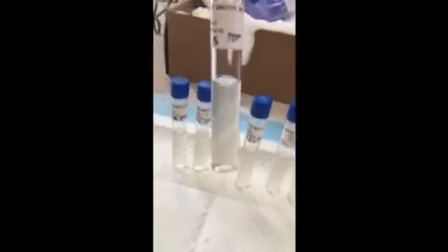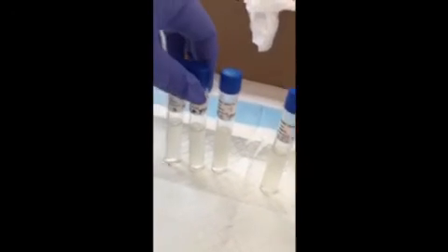Okay, this is for salt tolerance and pH testing. It's been 24 hours and you can see all of the broths are positive because all of them show turbidity. For the Epi5, you can see it's not really clear. I think most of them are all positive. I didn't see any that were clear.